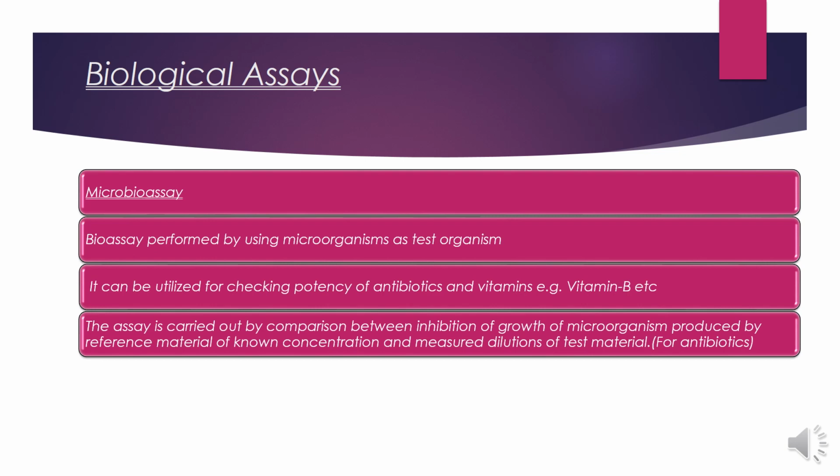Especially for antibiotics, we compare the zone of inhibition produced by both the test antibiotic as well as the standard antibiotic, and then evaluate how active, potent or effective the test antibiotic is in inhibiting the growth of microorganism in the petri dishes or in the test tubes.